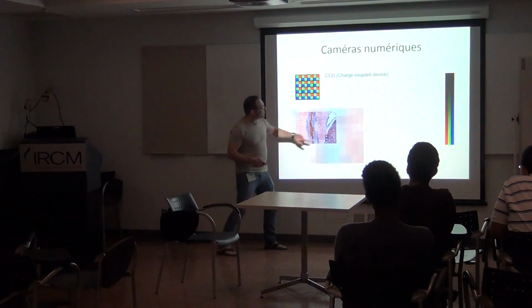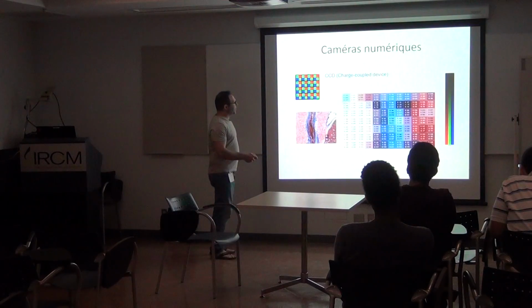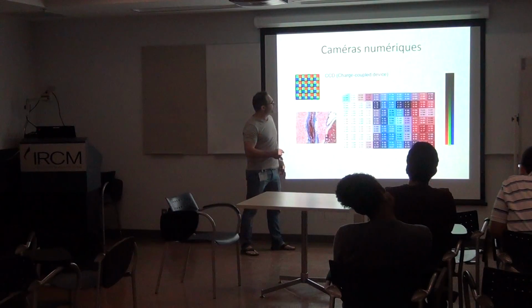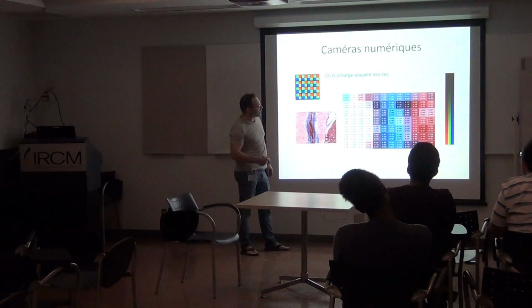So let's say I take this region here and bring the pixel value. If something looks mostly blue, the blue component is greater, 234. There is still red and green data, and a white pixel would be 255 for every value here.